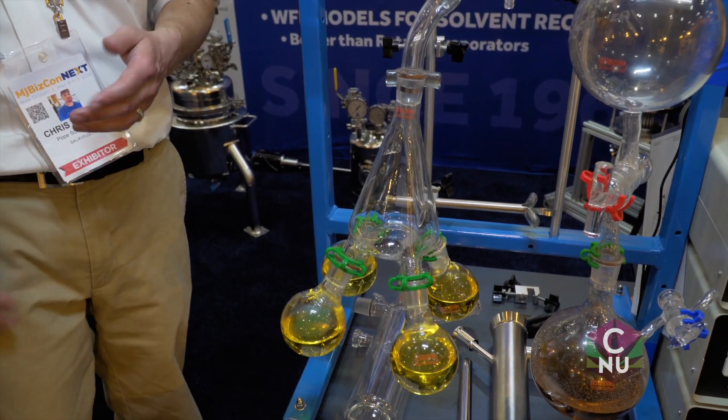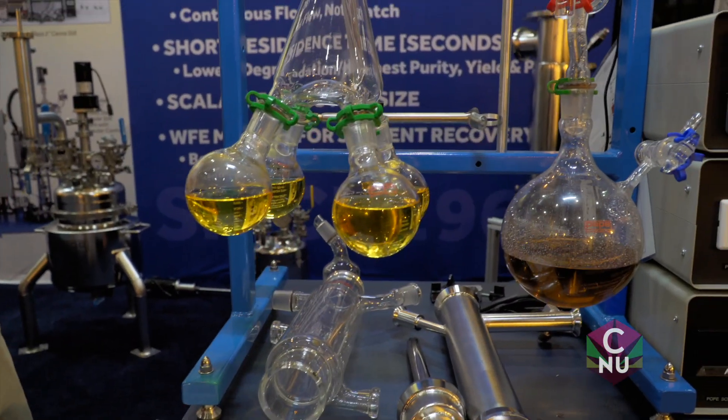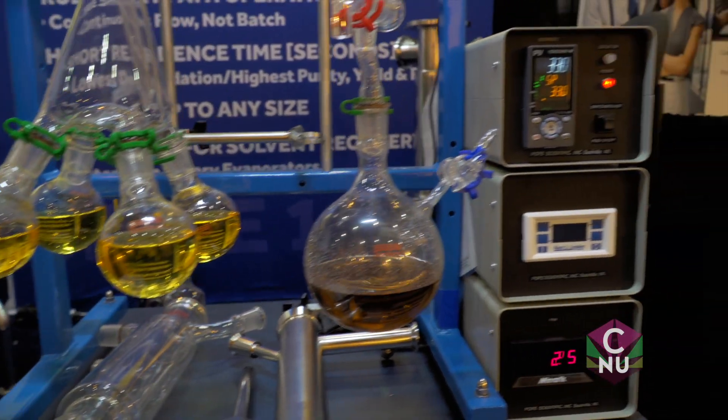Everything you see behind me is just taking this same technology and scaling it into larger equipment. And what is the ultimate product? For most cases this would be vape pens, shatter, things like that. Edibles not so much, because the idea of this distillation is to really bring up the aesthetics — you want nice, good color. The idea is to make this stuff so you can sell it on the market next to the guy that has not such good stuff.